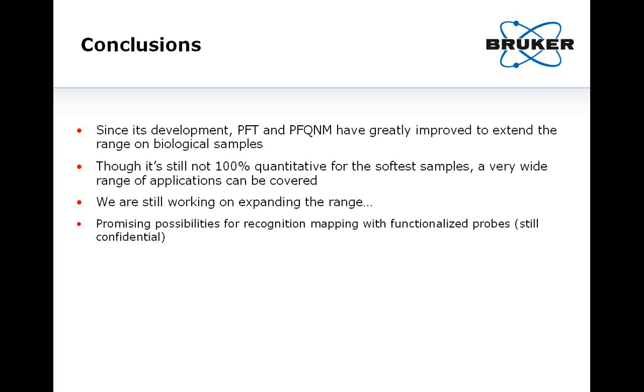We're still working on improving the technique, which is already good, which already gave excellent results on living cells. I think you have pretty good examples in that presentation. Also, PeakForce QNM might work with functionalized probes and might offer very interesting perspectives, but this requires further testing and maybe further development.